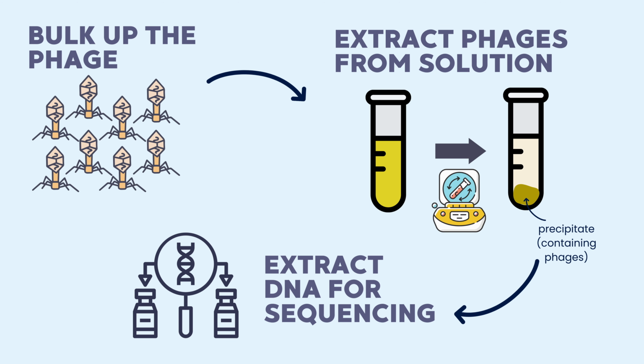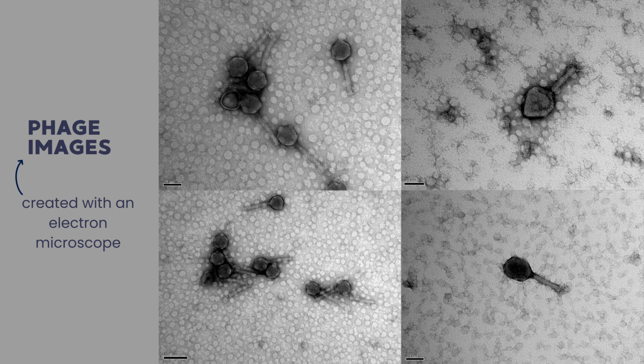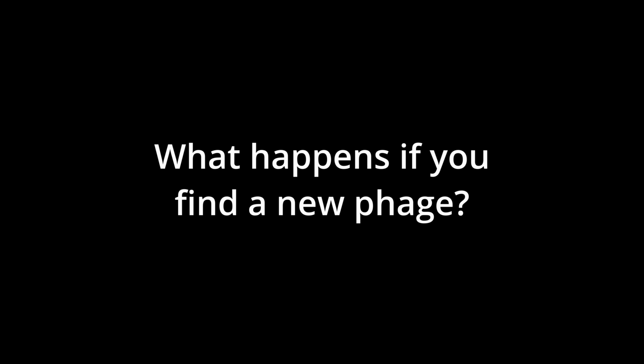So we bulk up and we grow a large amount of the phage, and we precipitate it out and extract the DNA and sequence it, and we find out what type of phage it is, what properties it has. And we also send a sample for transmission electron microscopy, which gives us an image of the phage, and that helps us identify what type of phage it is and what family it belongs to.